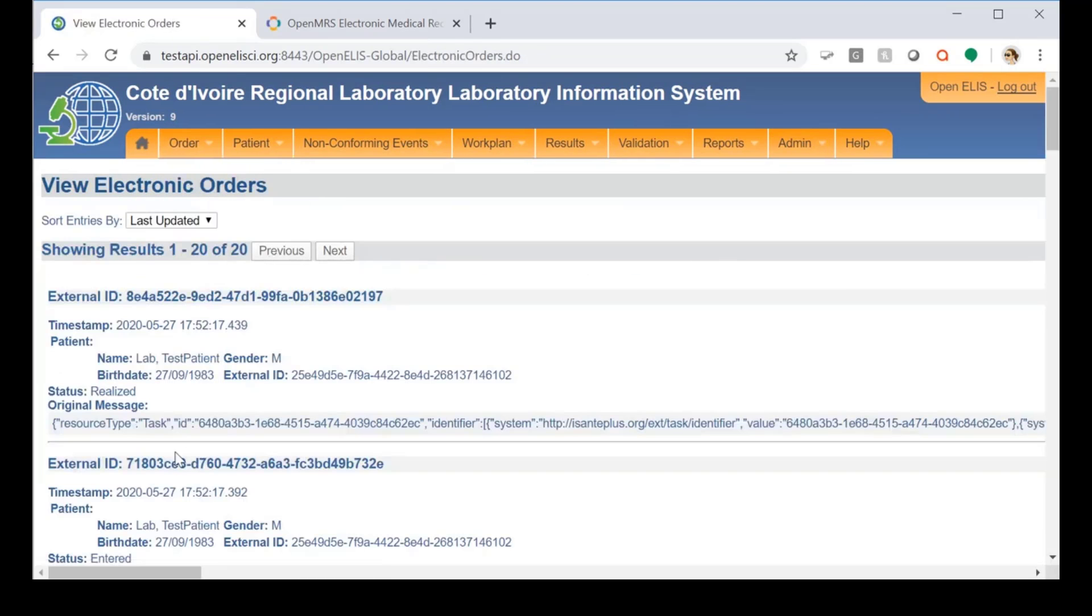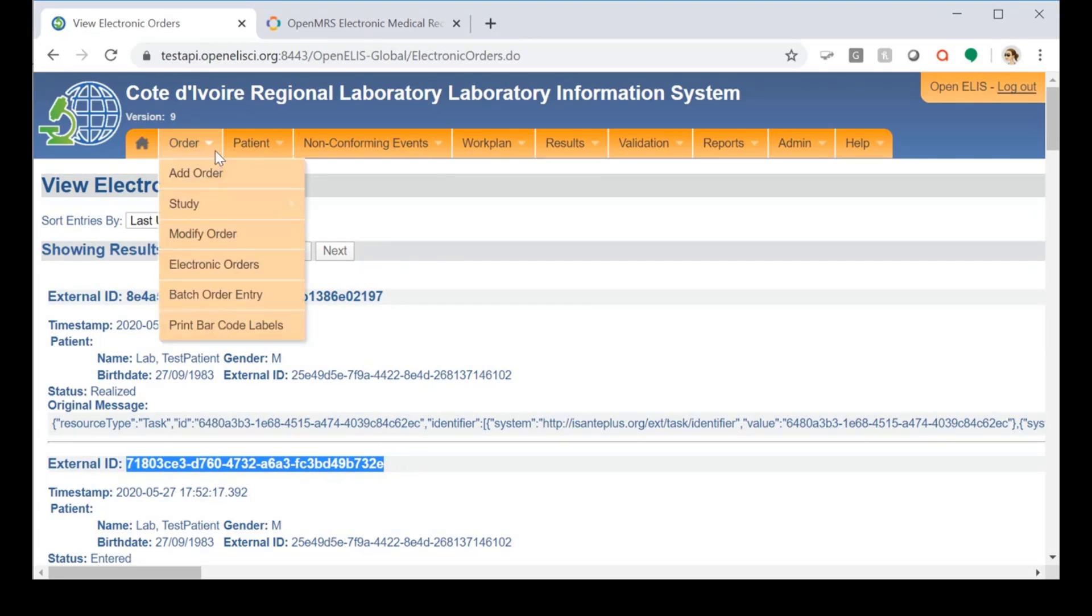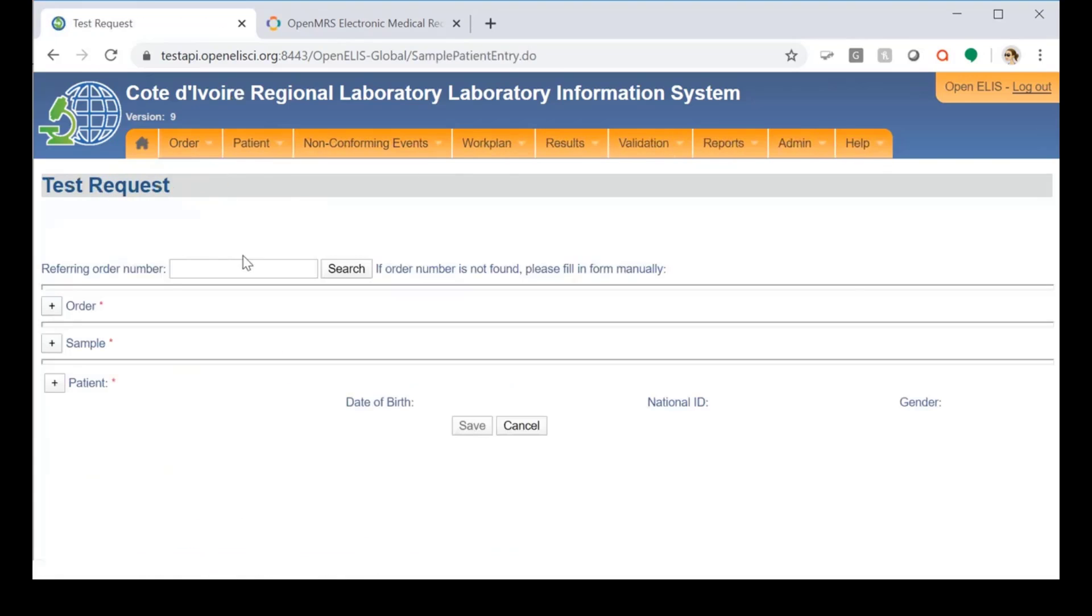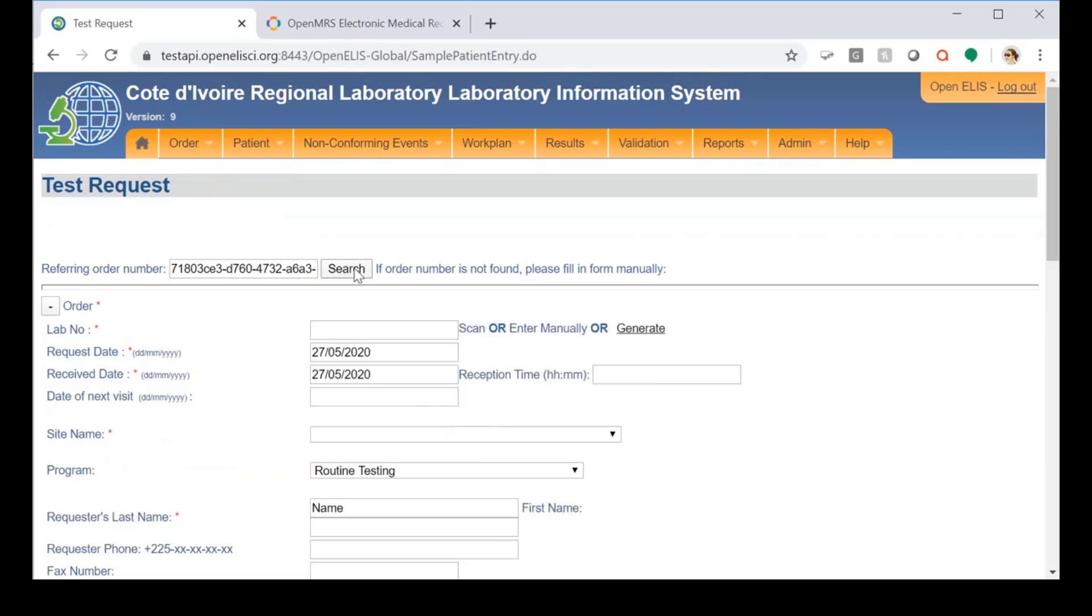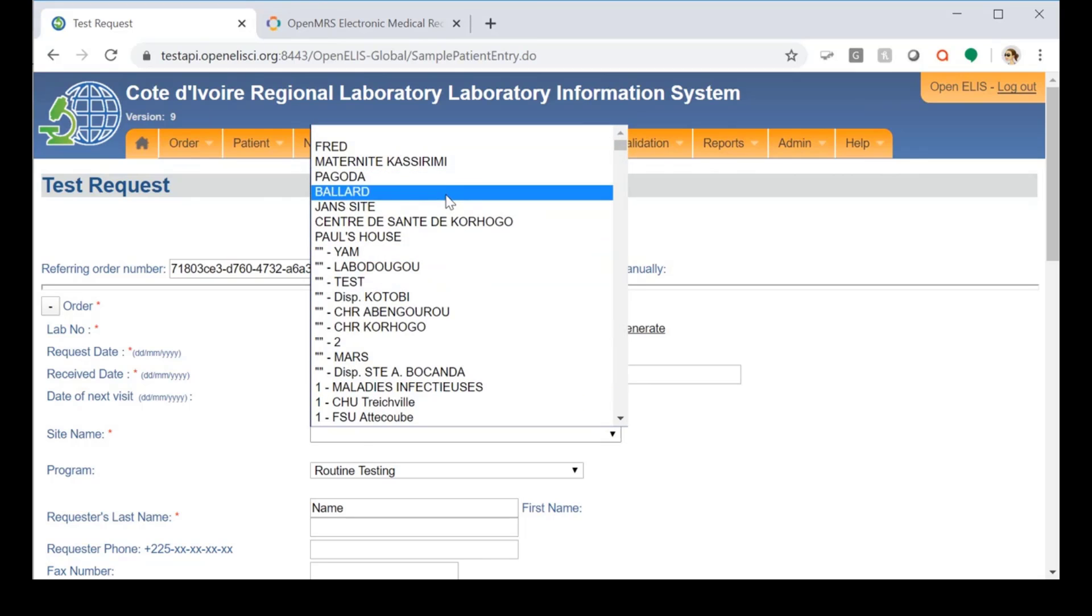We're going to do the same thing for the other test in the order. And this mimics the laboratory workflow of receiving a sample, assigning it an ID, and preparing it for processing.